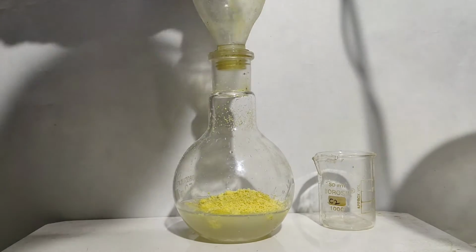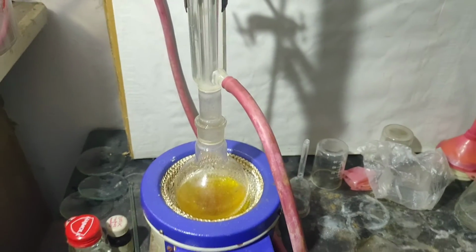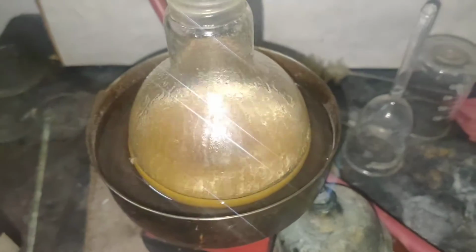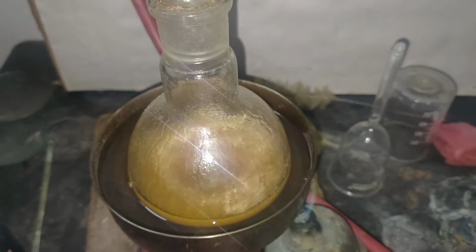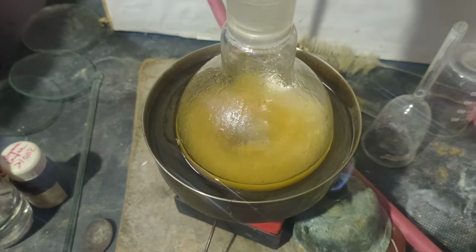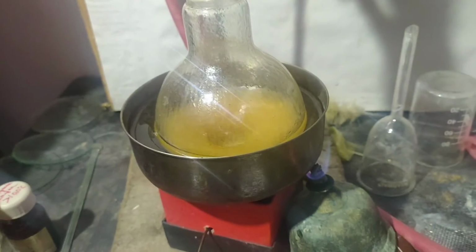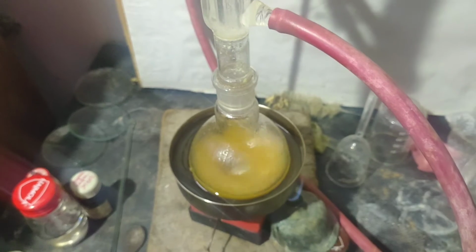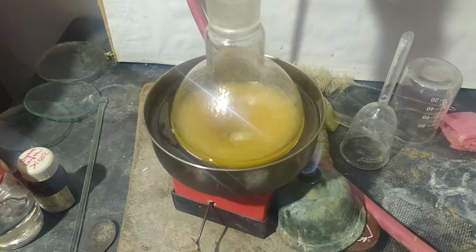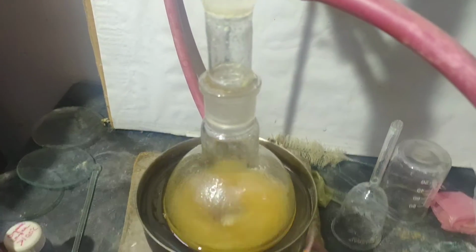Then I set the flask on a heating mantle with a reflux condenser. I refluxed it for 4 hours, but the solution did not become homogeneous. Maybe due to the absence of strong stirring, the reaction is too slow. I didn't have a hot plate with a magnetic stirrer, so I heated it on a water bath and stirred it with my magnetic stirrer. I even added 10 grams of sodium metabisulfite into it, but still the solution remained the same.